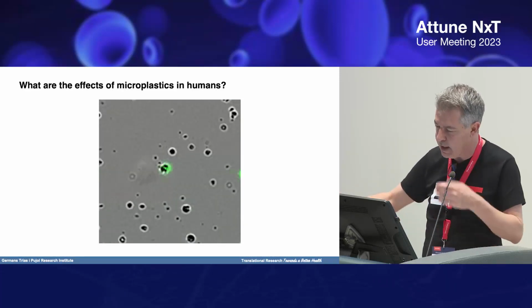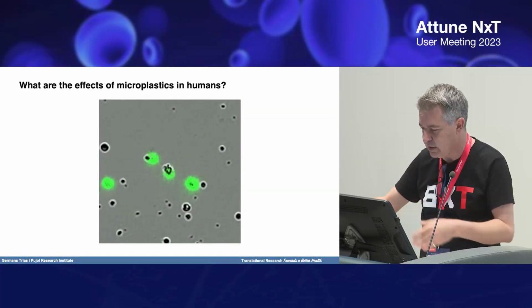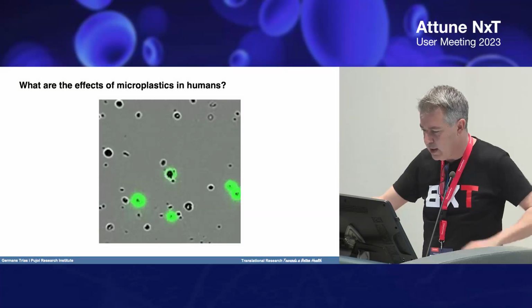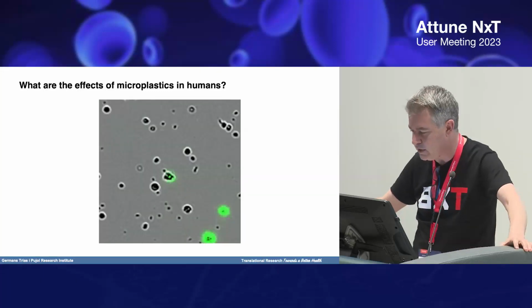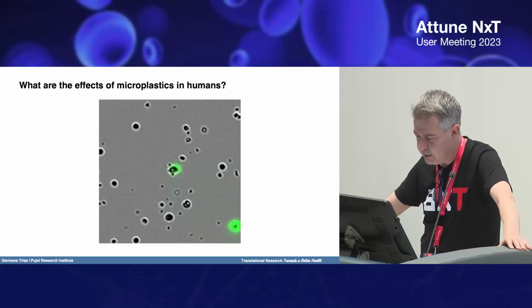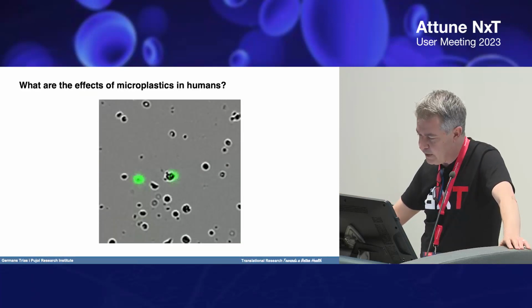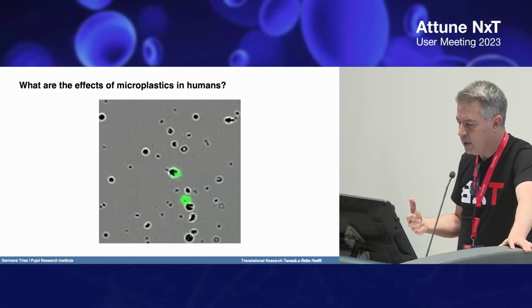The glow makes this plastic particle appear larger, and the size of these particles is only 3 micron. During 2 or 3 days, the macrophage is trying to engulf this particle, and at the end, the macrophage will die.